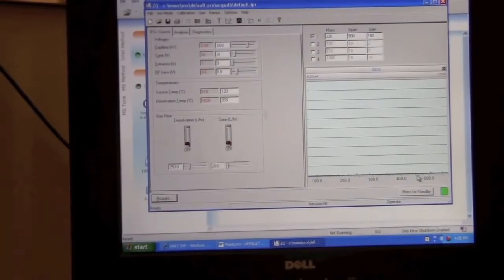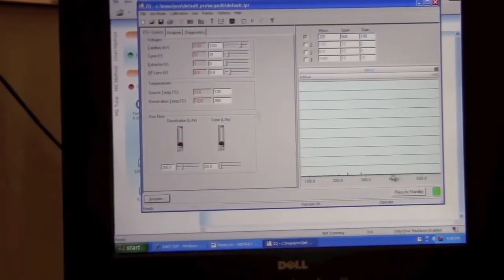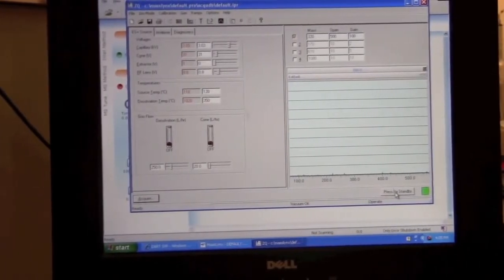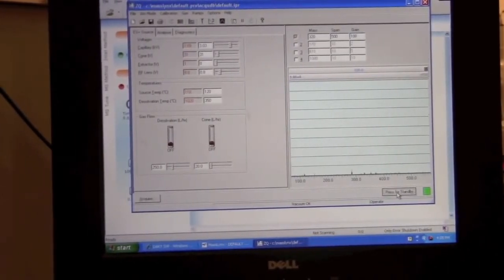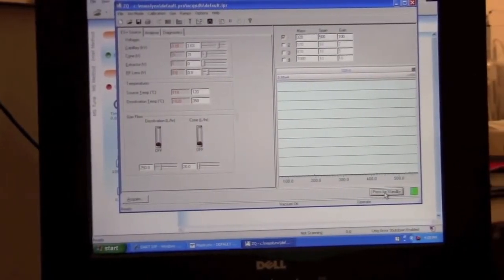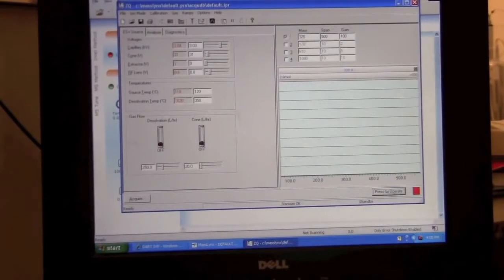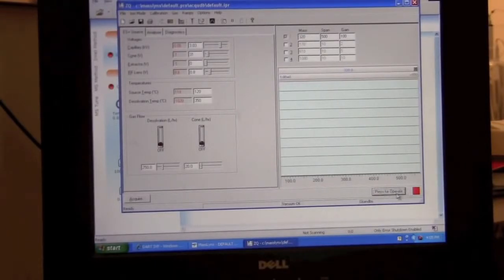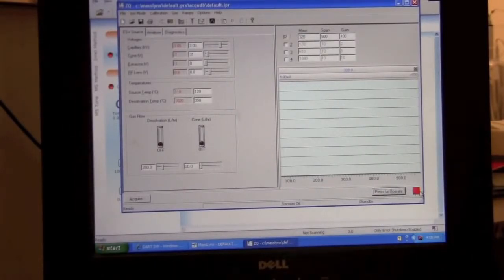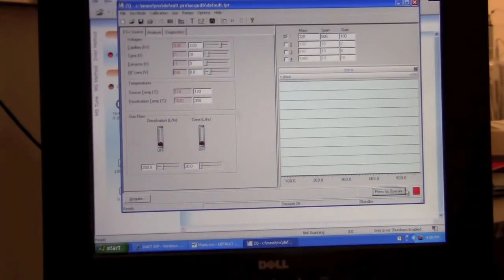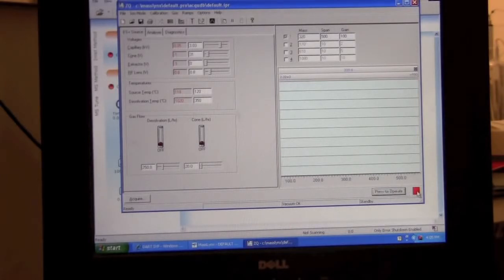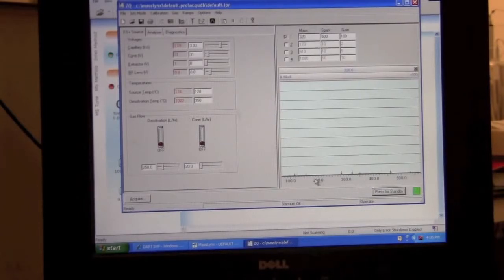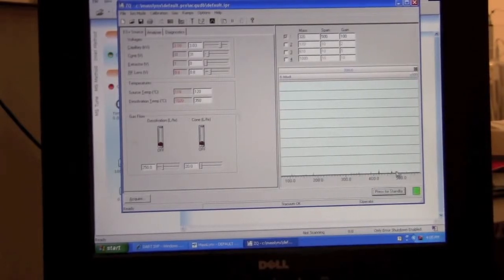If the mass spectrometer is not already operating, you want to click this button to put the mass spectrometer in operation mode. If it's red, it's not operating. If we start it operating, the light should be green. And we may see some ions in the mass spectrometer.